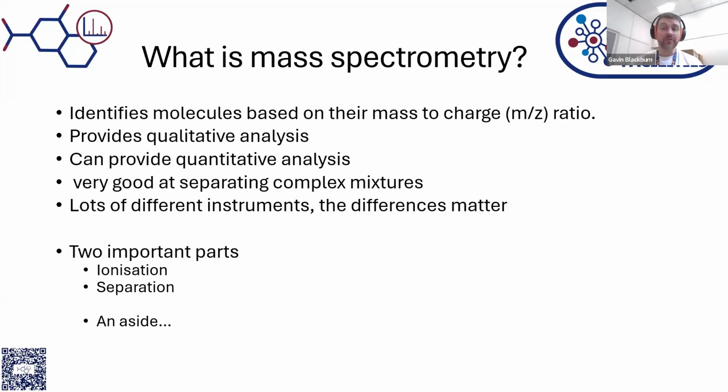And when we separate those out and we detect the signals for separating those out, we can functionally, when we're talking about biological mass spectrometry, get a formula for those things. Now, that doesn't necessarily identify a molecule. There are loads and loads of molecules, particularly when we go and talk about lipidomics and metabolomics, that have exactly the same formula, but are put together in a different way.